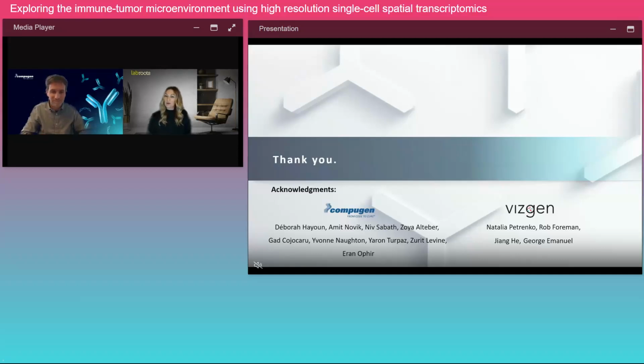Very good. And how many genes and transcripts per cell do we detect? Is it enough for confident integration with scRNA-seq data? Yeah, so one of the reasons that we chose MERFISH, and we compared different methods even recently, is the fact that you get this nice depth of detection in individual cells.